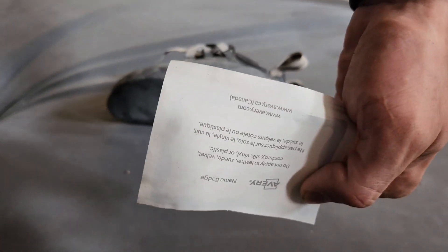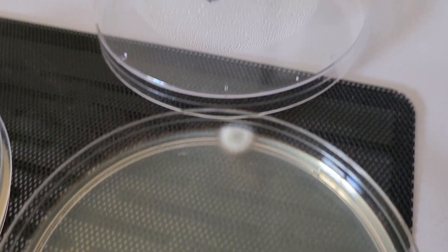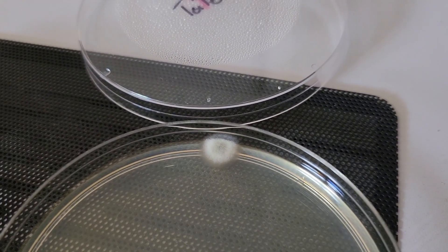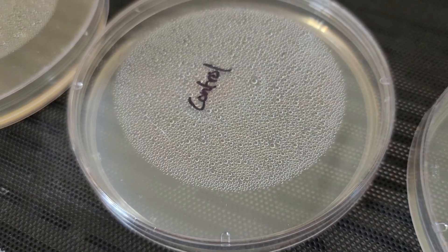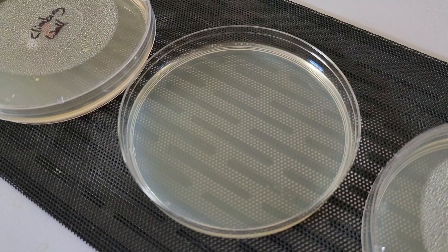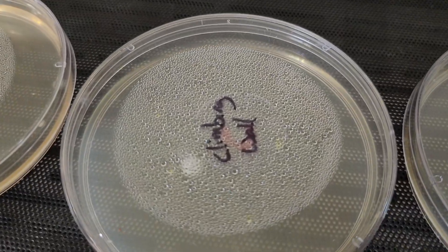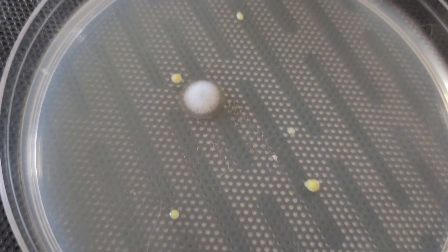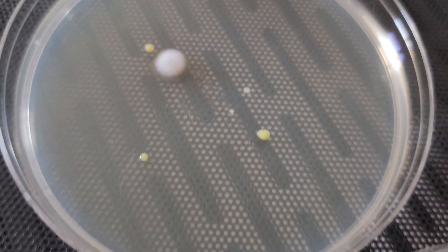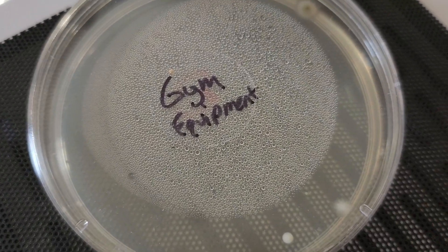It's worth noting that these are being incubated at their recommended temperatures. Here is the toilet on day two — a big puff continuing to grow and some smaller puffs in the middle, still equally gross. The control is the same, nothing to report there. On the climbing wall the growths continue to get bigger and the white puff in the middle is also getting grosser. On the gym equipment there's continued growth — a white puff, a white glob, and then in the upper right corner there is a darker glob.